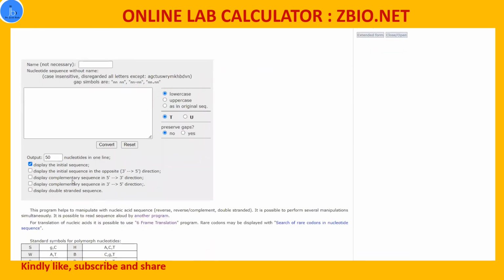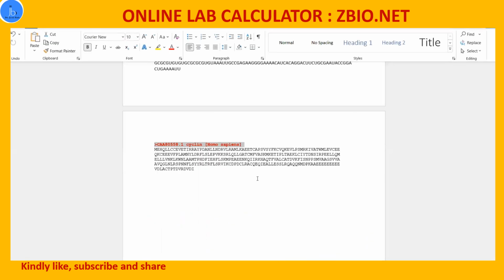And for conversion purposes also, if you want to get the ideas about the complementary strands, 5' to 3', 3' to 5', if you want to get the ideas about the double strands, then you can do these things. Let me show you if I have some samples.